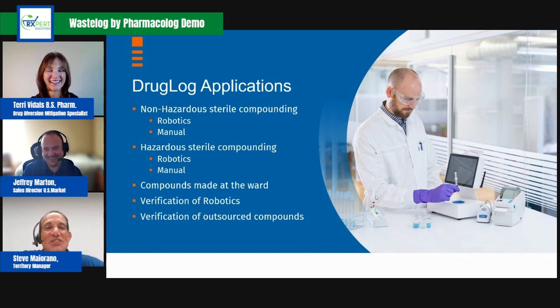All right. So yes, since we last spoke, DrugLog has gone through the FDA process and we now have it available on the market. And some of the applications for DrugLog, as you mentioned, Terry, in the pharmacy, is testing of compounds, whether it's hazardous, non-hazardous, whether they're manually prepared or done by robotics.